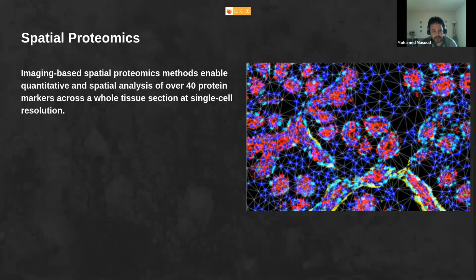Maybe we can start from one single omics like proteomics, or we can integrate it with another omics domain like genomics to get more comprehensive insight into tissue biology and discover novel biomarker signatures.